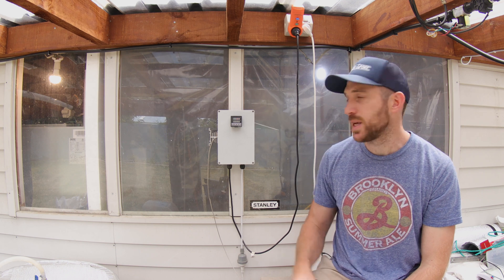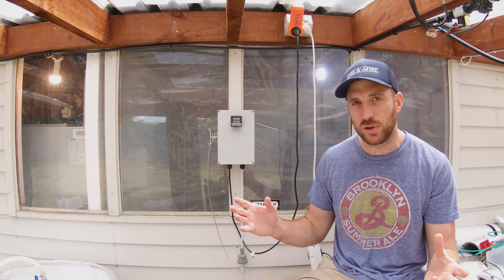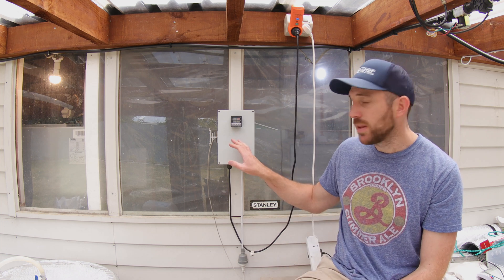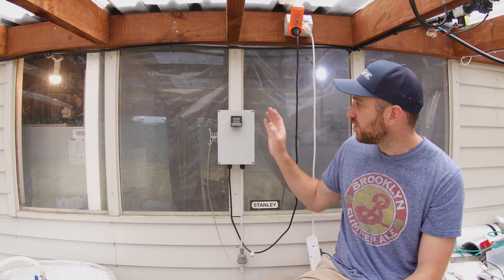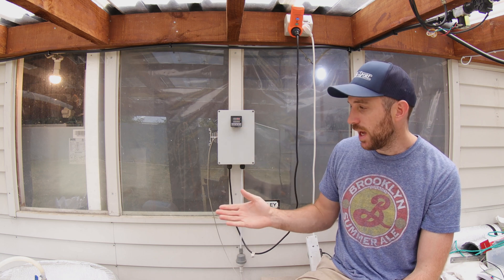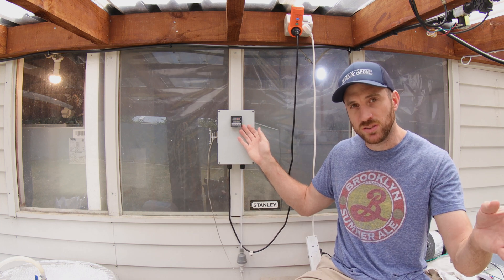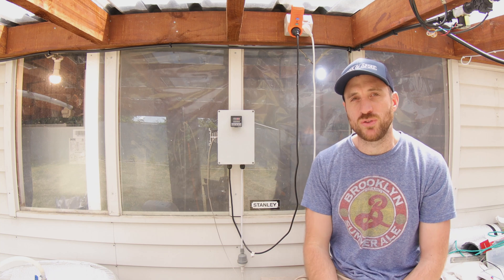The second item you need to look at getting is a process controller, or PID controller. PID controllers are brilliant because they'll control a function for you so you don't have to. For mushroom growing, they're brilliant for controlling the temperature going to a device like a sterilizer. You set these up for a specific temperature and they have a temperature probe which runs off them. They'll power the device on until the probe detects that temperature, and then flick the device on and off to keep your device at that temperature.